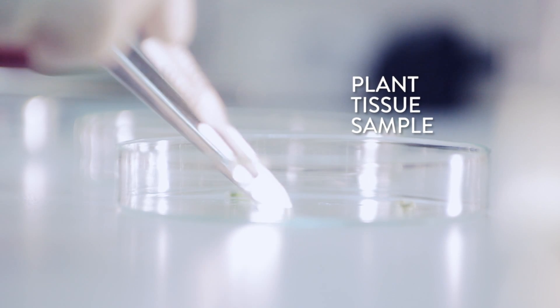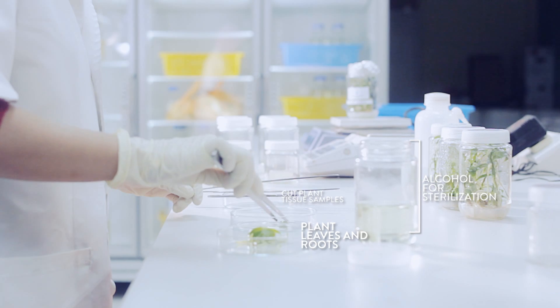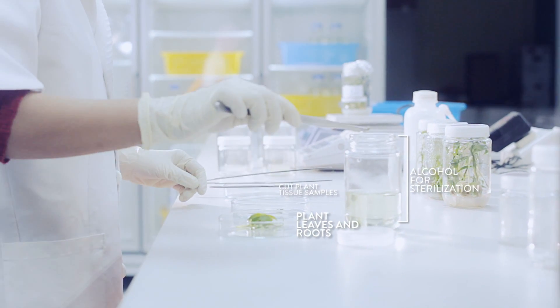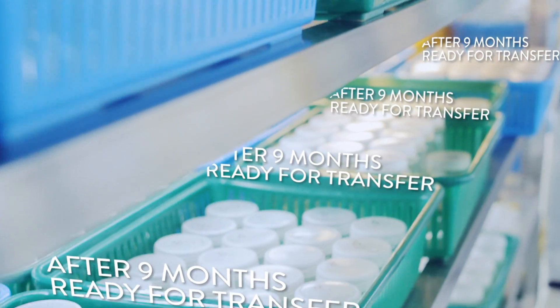Each piece can be used to grow a complete plant. They are placed in a glucose gel that will be changed once a month. The tissues will be kept or incubated in this way for nine months.